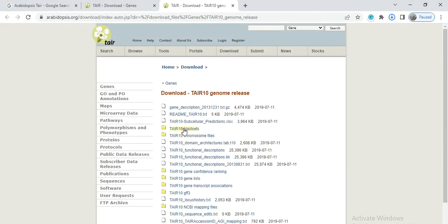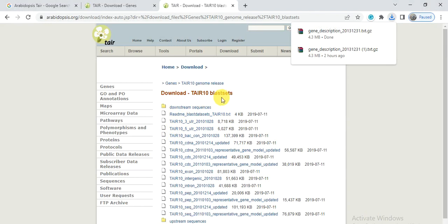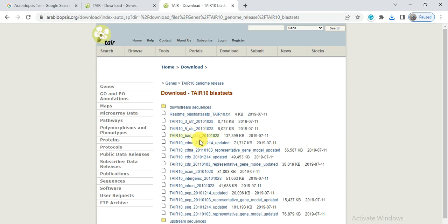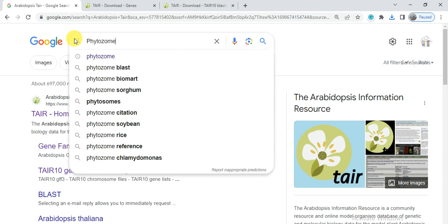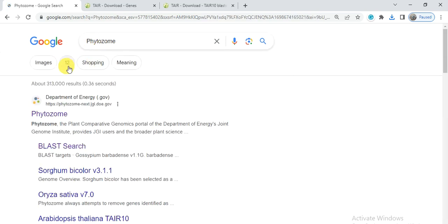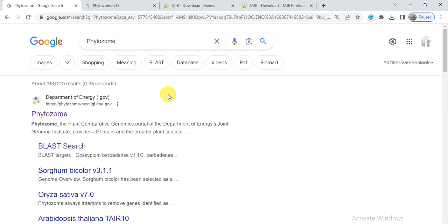From the downloads page, click on the TAIR10 block sets to also download the cDNA file and CDS file. Here is the PEP file and the genomic sequence file. We will download all files, but the most important is the PEP or protein file. You can download it from the TAIR website or from Phytozome — I already have a video on how to download genomic, GFF, or related files from Phytozome, so you can refer to that.